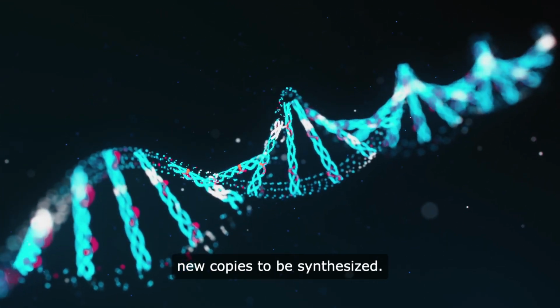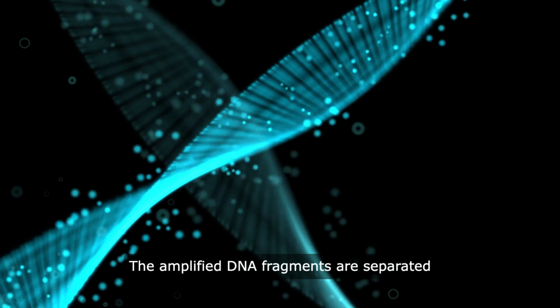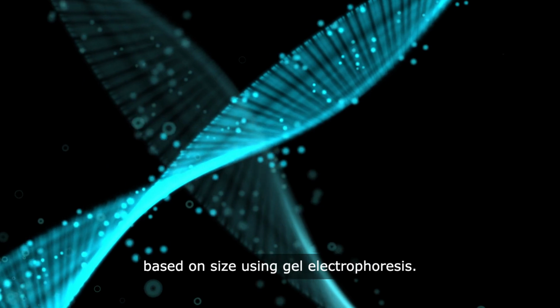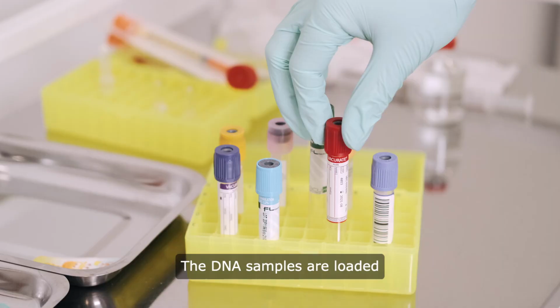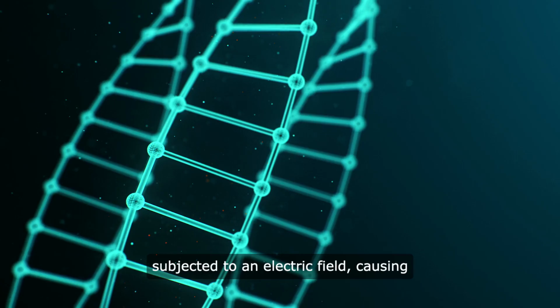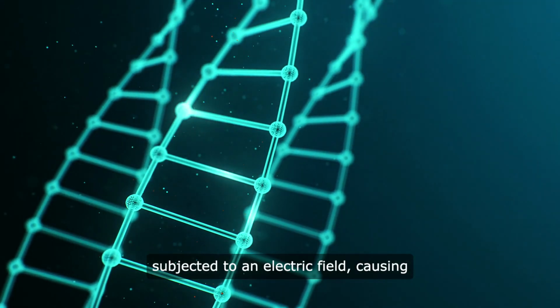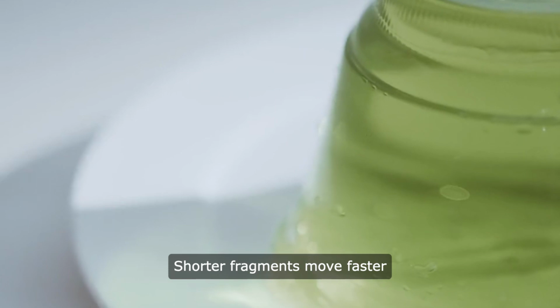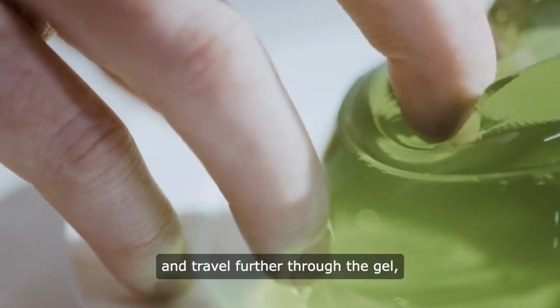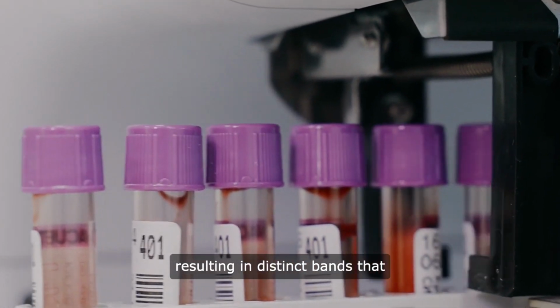Gel electrophoresis. The amplified DNA fragments are separated based on size using gel electrophoresis. The DNA samples are loaded into wells in a gel matrix and subjected to an electric field, causing them to migrate through the gel. Shorter fragments move faster and travel further through the gel, resulting in distinct bands that represent different DNA fragments.